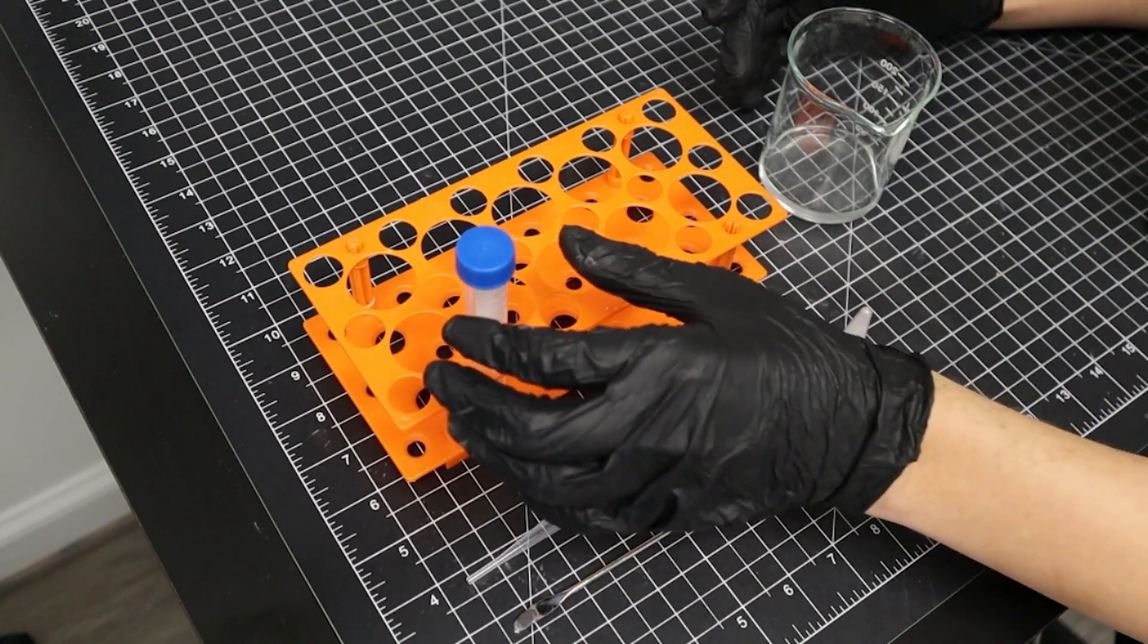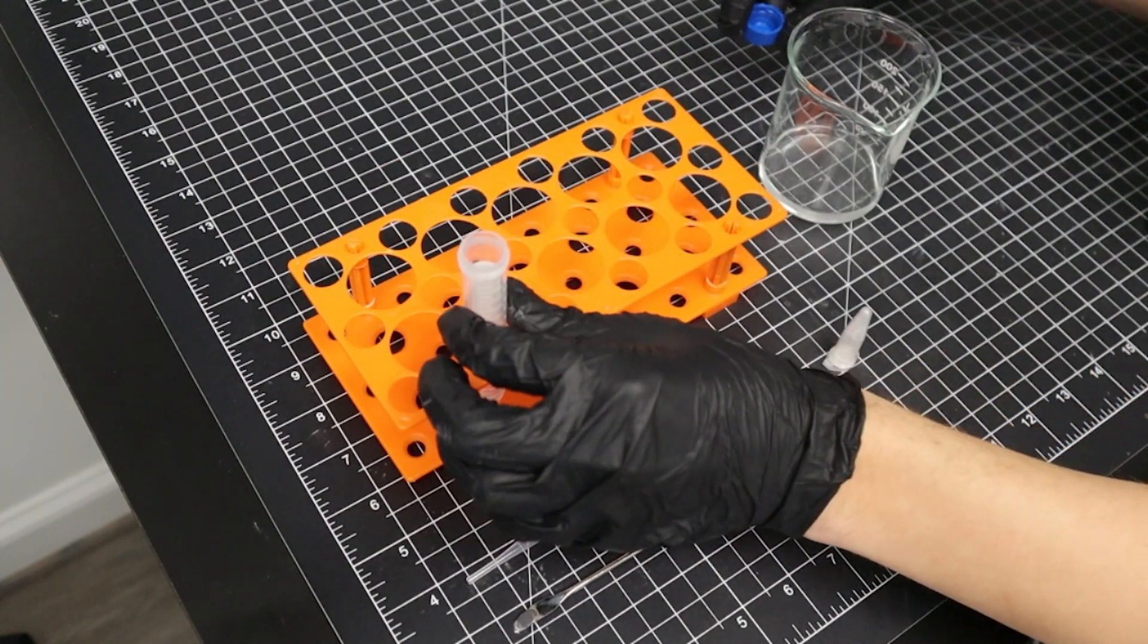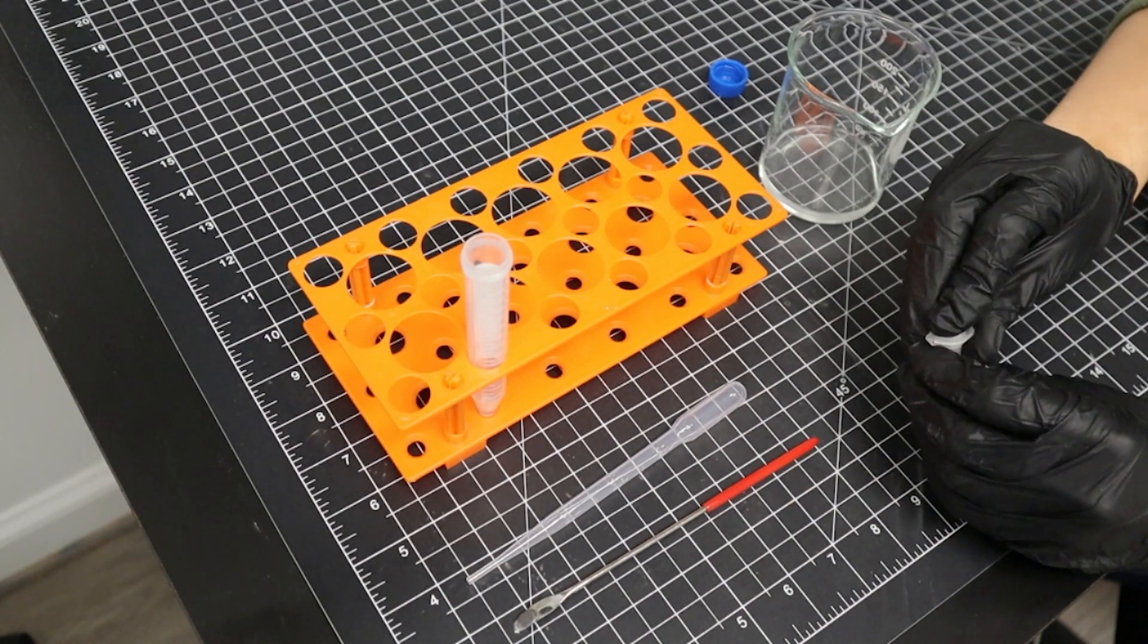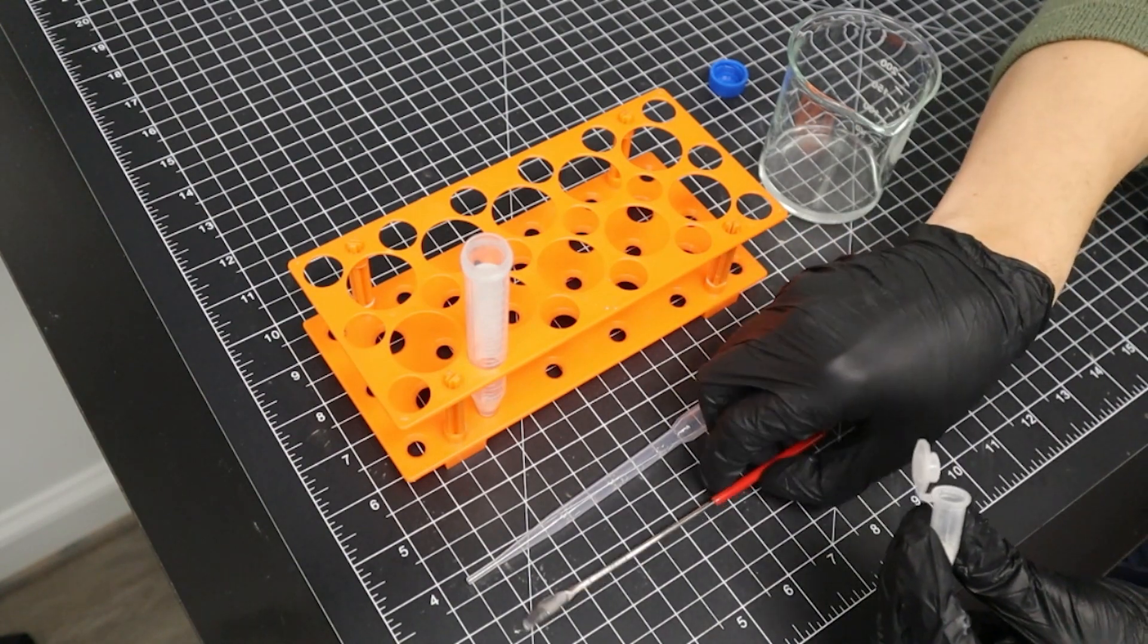We'll start by loading our vial with powder. We don't need a large amount of powder to create a solution, so just fill the tip of the metal spoon with powder, and then deposit into the vial.